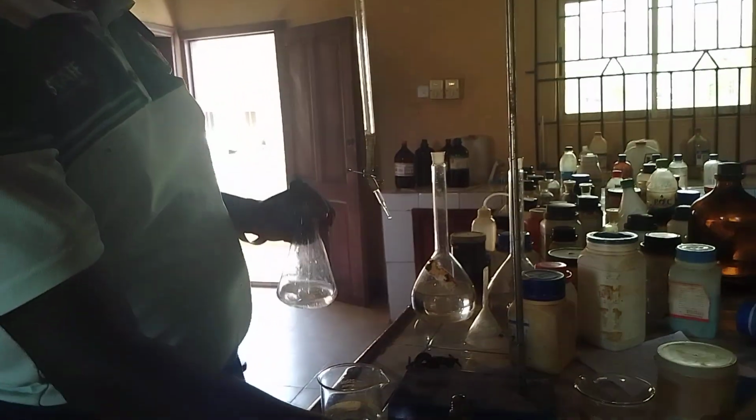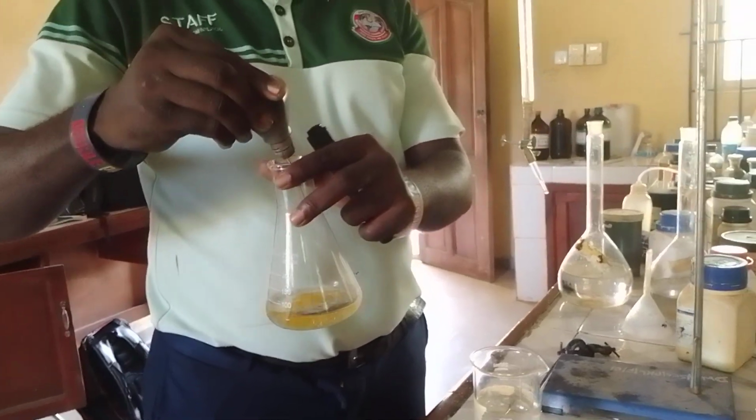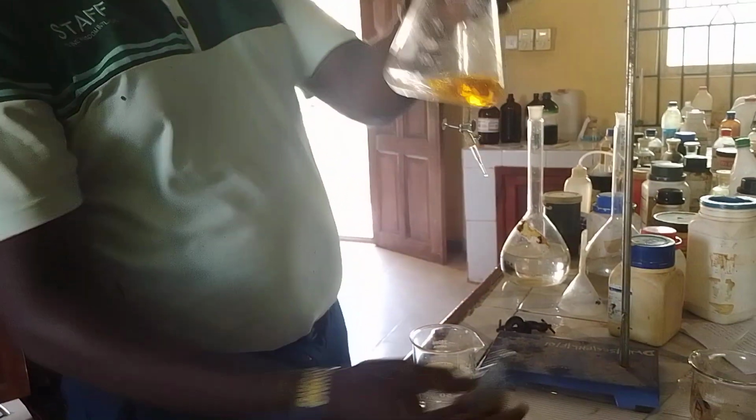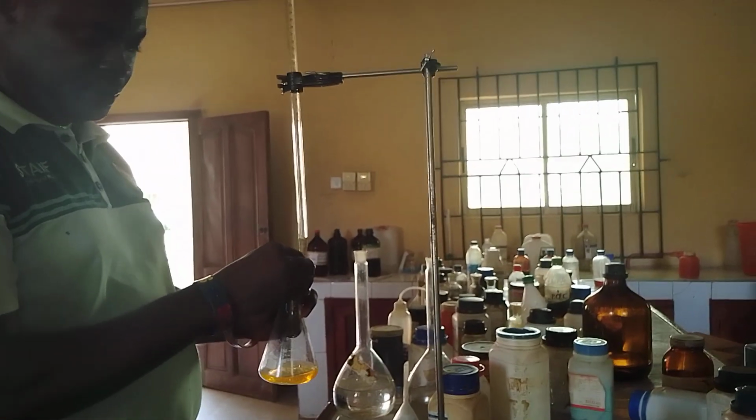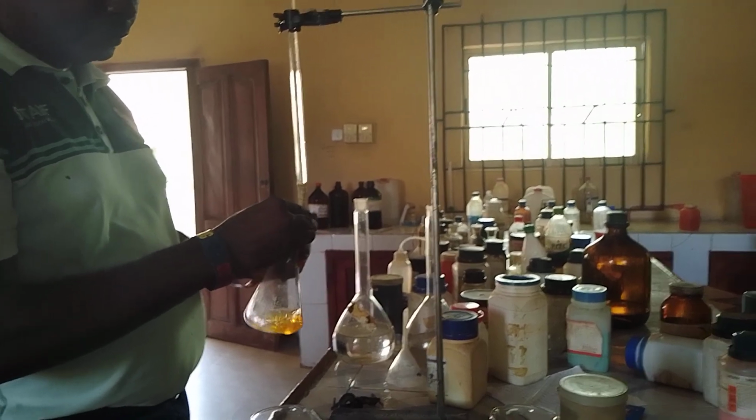So then I'll put my methyl orange, 2 drops or 3 drops. So then the solution is yellow already. Then I will come here and titrate.